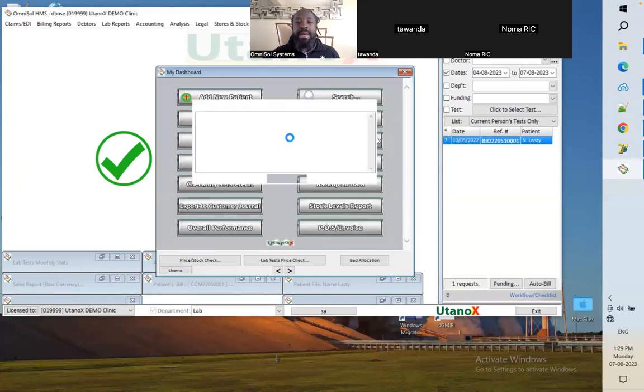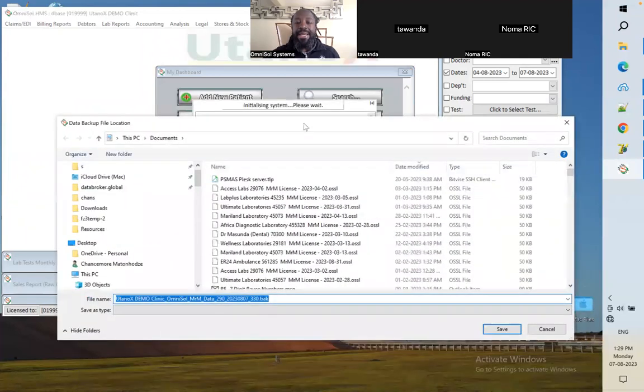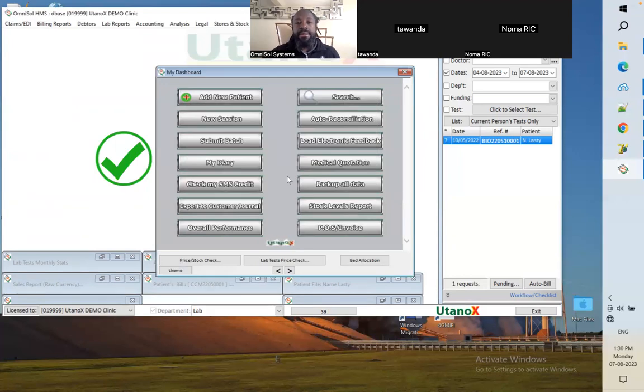This allows the system to make a copy of the whole database onto something like an external drive or a flash disk, so that you have a copy which is away from the server in case something goes wrong, which can happen. But regardless of this, it is making another copy anyway in parallel on our web platform. But it's important to have your own copy.